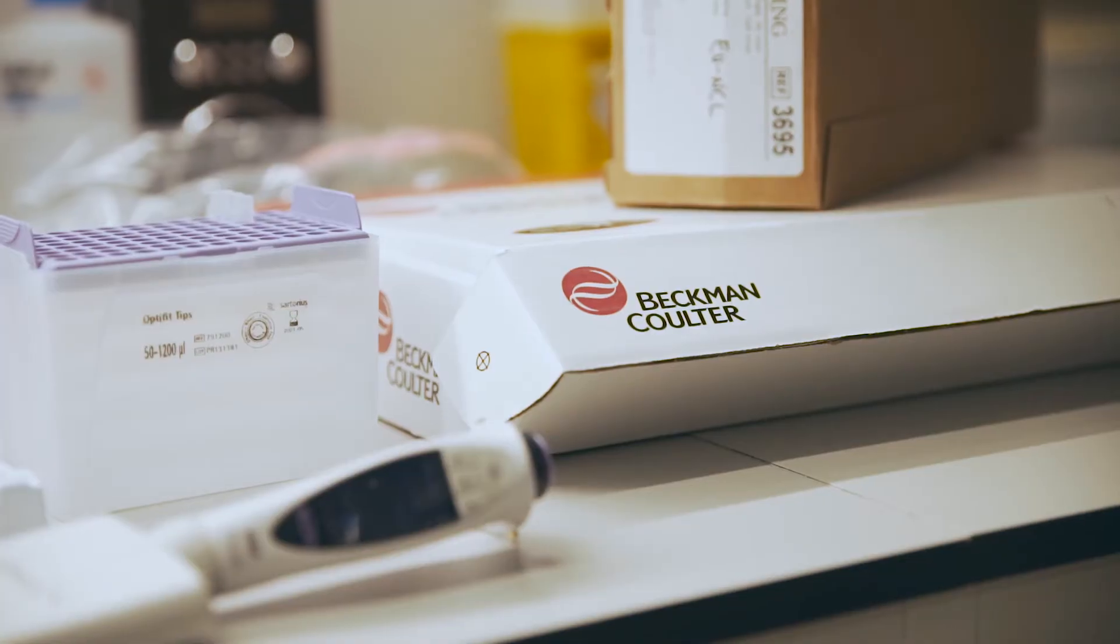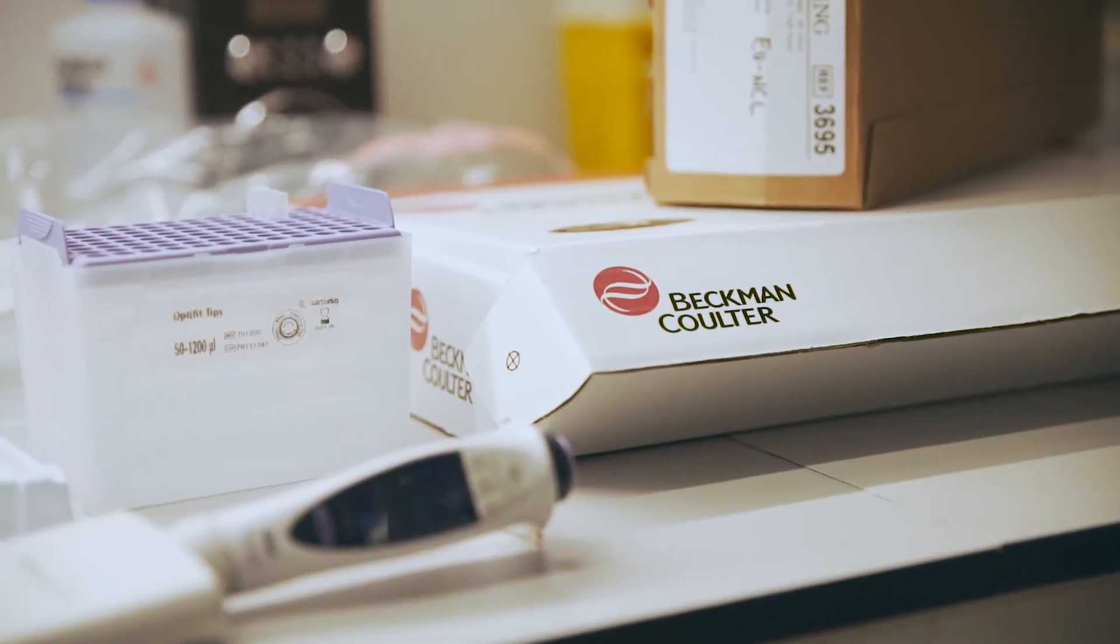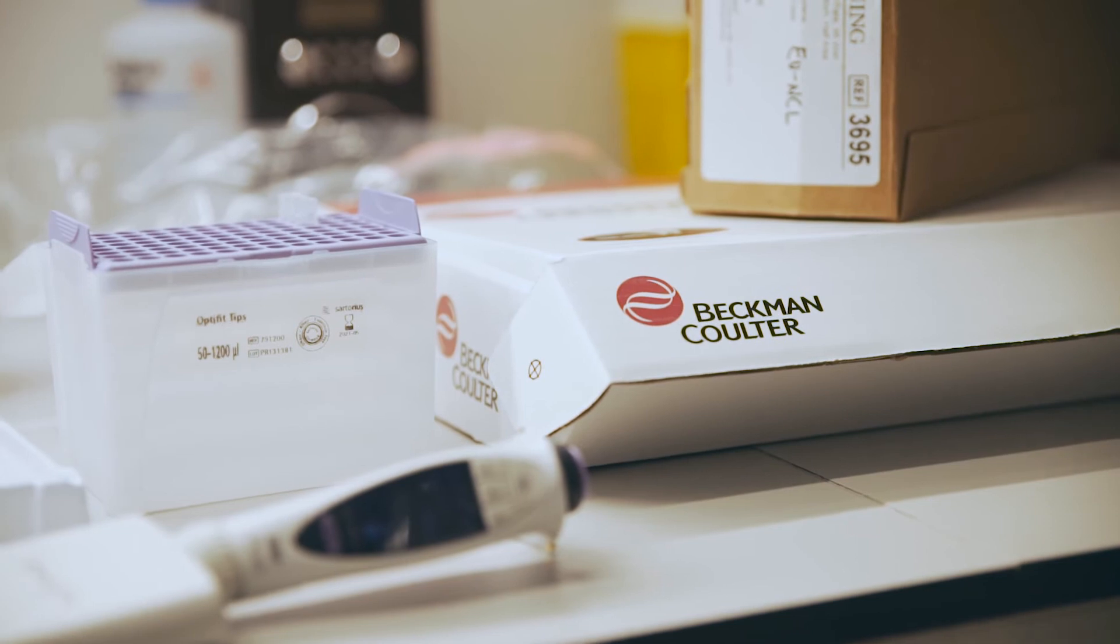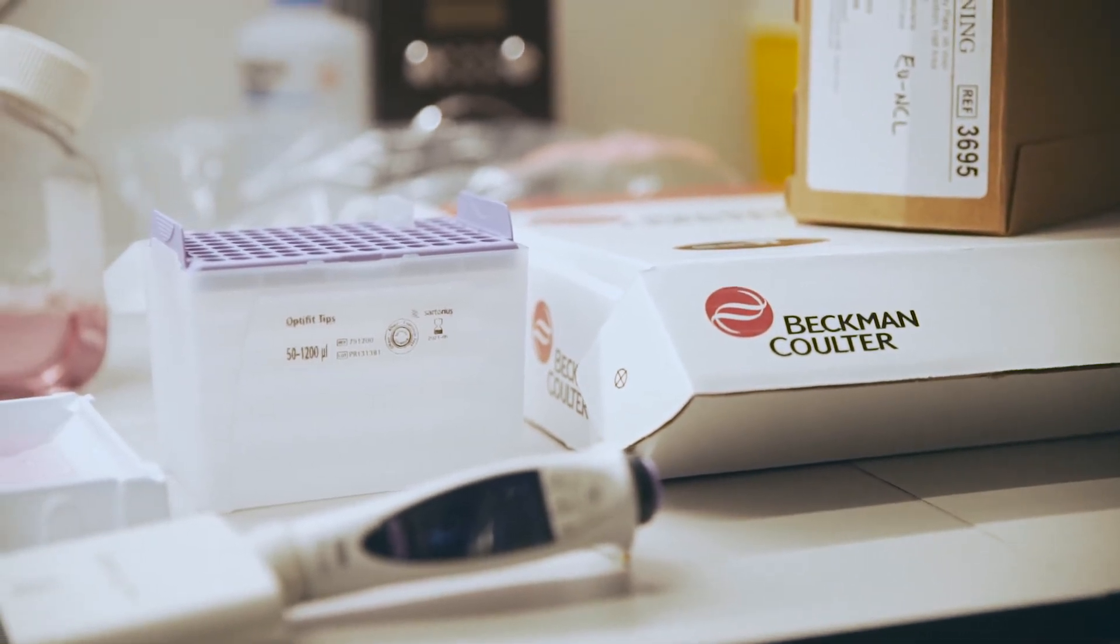Biomech tips are tested for biological parameters and are certified free below detectable levels of multiple problematic contaminants.